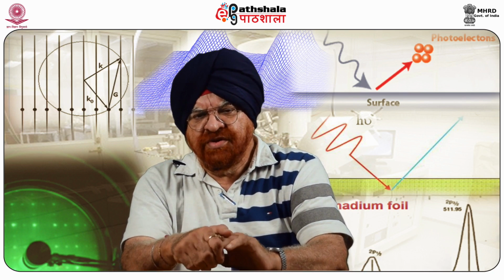In this context, chemical state refers to the local bonding environment of a specific species in question.